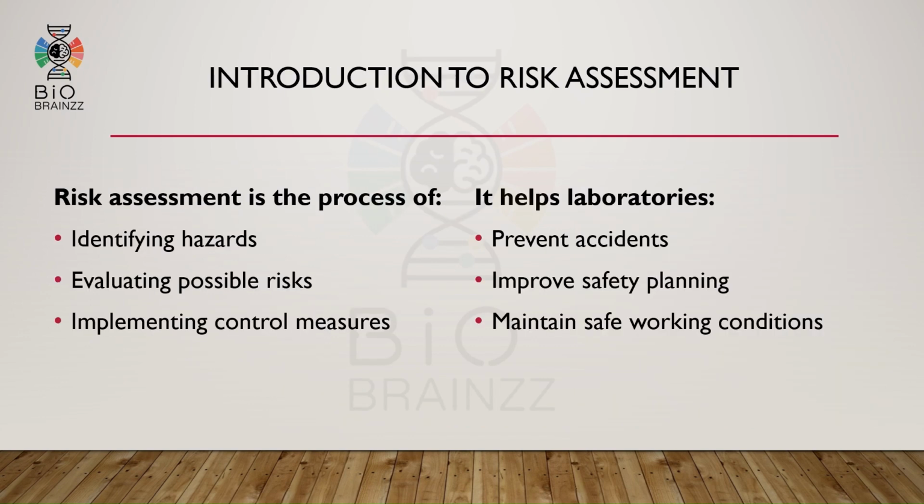Now, let us move to risk assessment. Risk assessment means identifying possible dangers before starting laboratory work. It helps laboratories recognize hazards, evaluate possible risks, and implement control measures before accidents happen. In simple words, risk assessment helps laboratories stay prepared instead of reacting after a problem occurs.